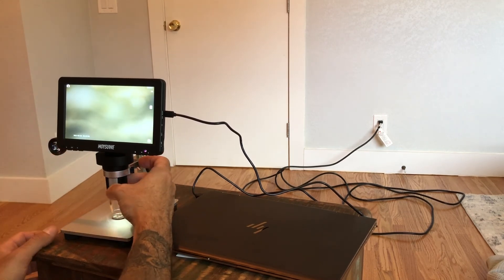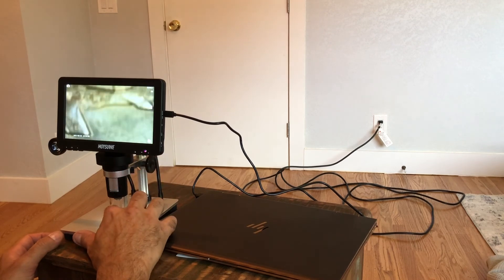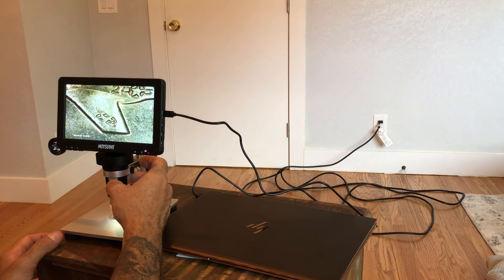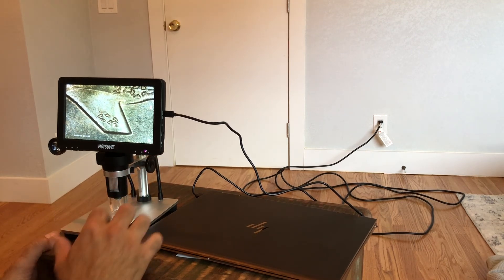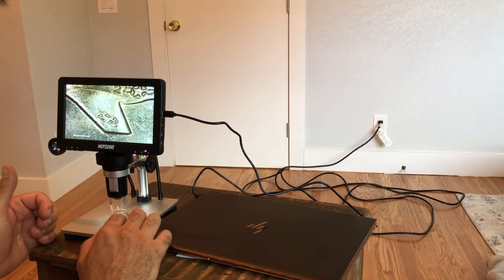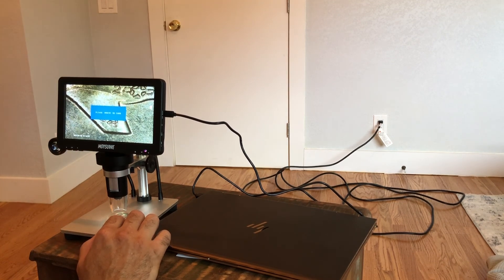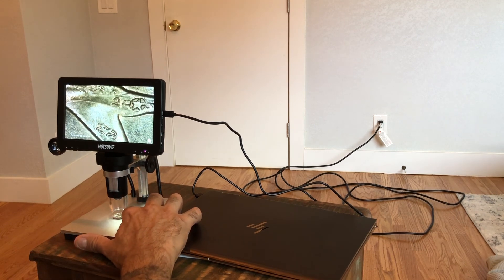We've got our kids now who are starting to get into school, so we're going to need to have a microscope on hand, and this one is great. It has that external memory slot, really simple to use. Overall really happy with what this product is and how it's been used, and looking forward to having it around helping us out and helping out our little ones.